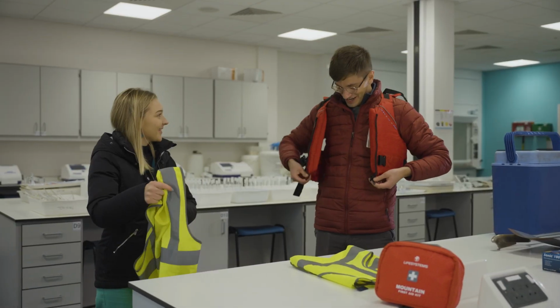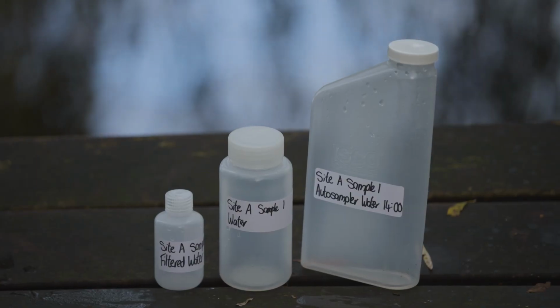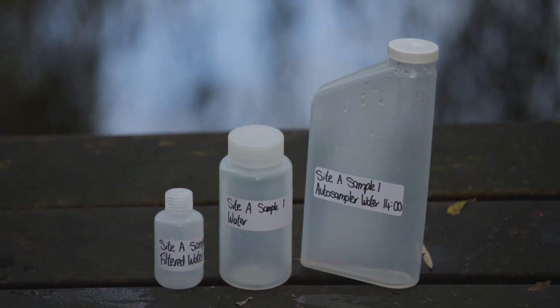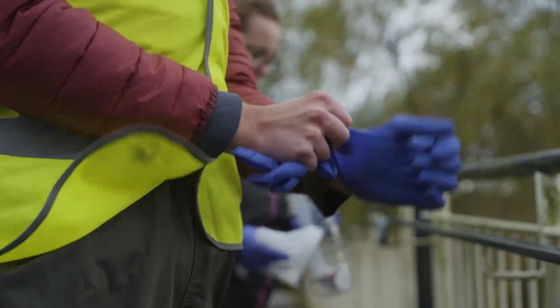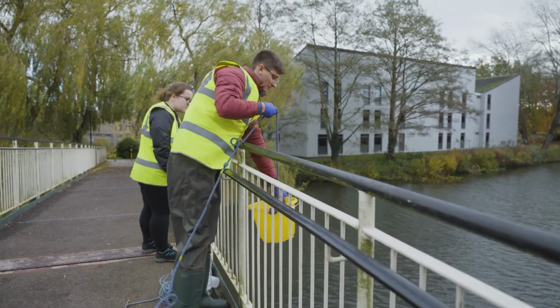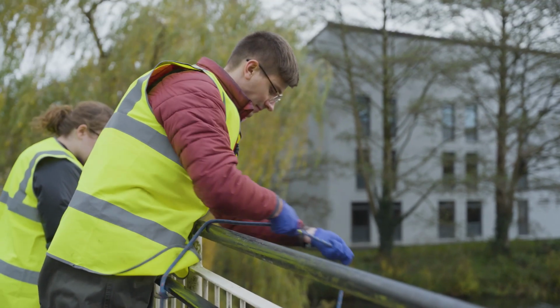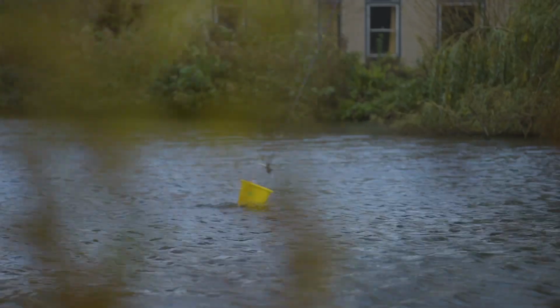Ensure you're wearing all the required PPE and all sampling bottles are correctly labelled with the time, date and location. Buckets and sampling bottles need to be rinsed with the water from the water body prior to collecting your sample. This is called conditioning your sampling equipment and must be repeated at each sampling location.